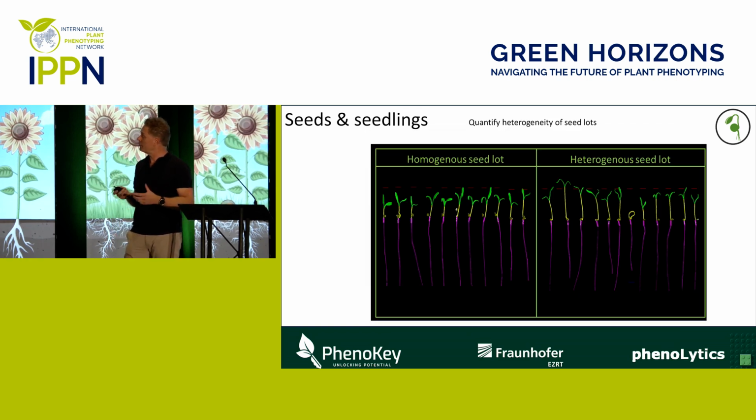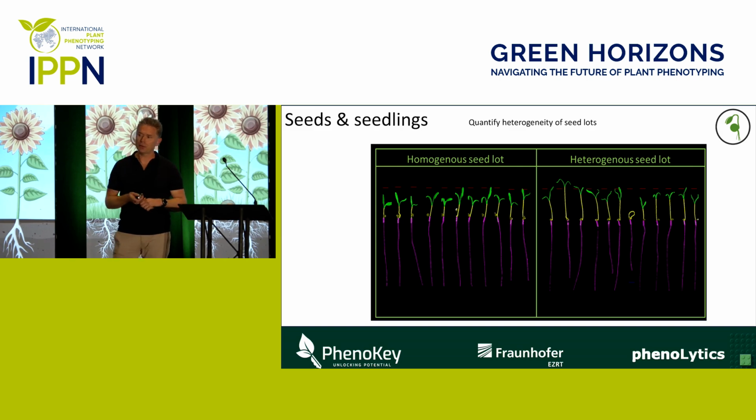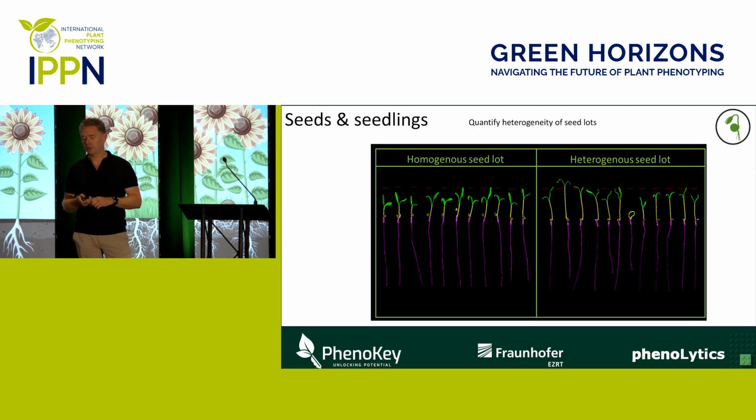Also, you can derive a lot of information about the heterogeneity or the homogeneity of your seed lot, which is pretty important if you want to sell the seeds to your customers. You want to know how they perform. And here you see 2 seed lots with exactly the same outcome from a traditional germination trial, but here you can clearly see the heterogeneity within the lot, and this can also be quantified in the output data points that you will receive.